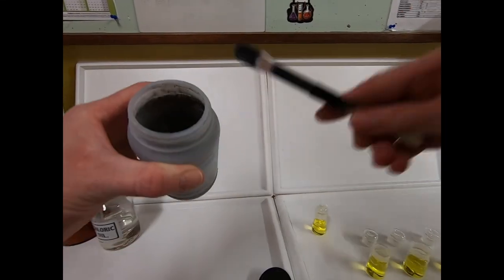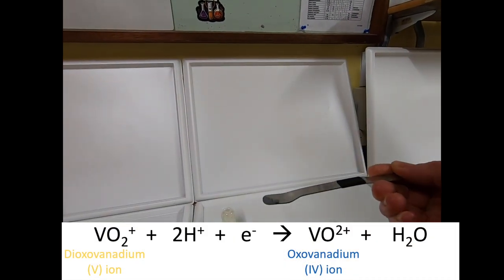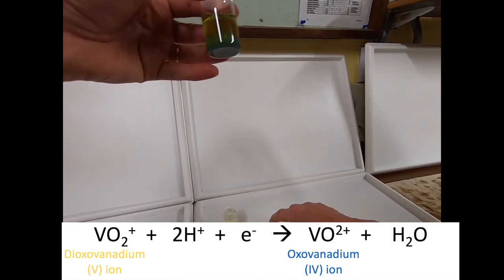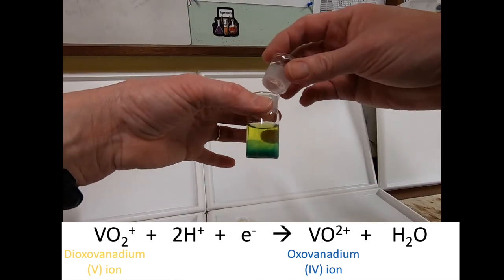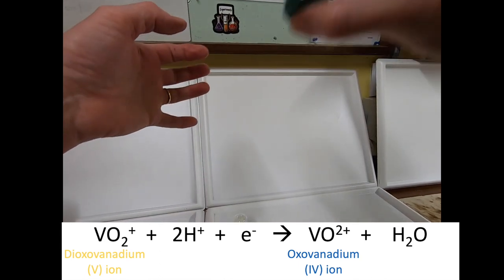We start off this reaction with a yellow solution which contains the dioxo vanadium(V) ions. When we add a small amount of zinc, this causes a reduction in the oxidation number of vanadium from +5 to +4. You'll see the solution change from yellow to blue as this reaction occurs.